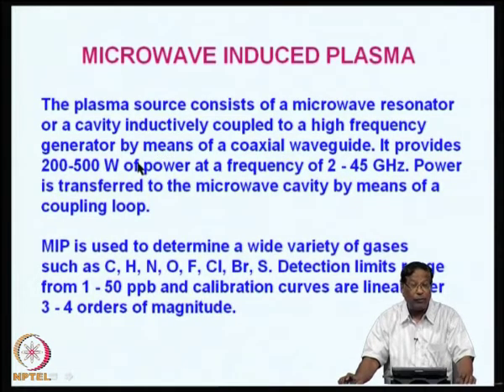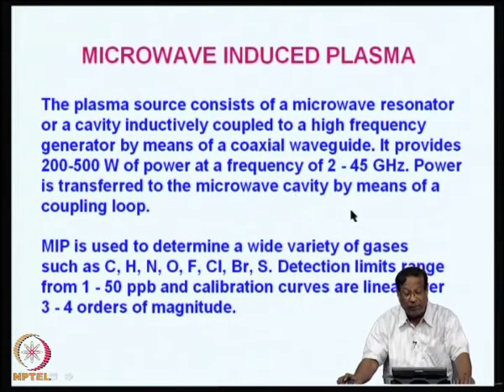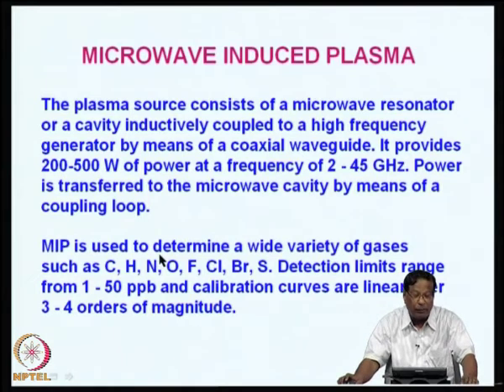It provides 200 to 500 watt of power at a frequency of 2 to 45 gigahertz. Power is transferred to the microwave cavity by means of a coupling loop.